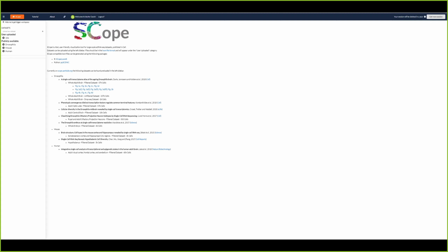A couple of caveats here. One is these are all pre-recorded videos. Hopefully they'll play at full frame rate, so you'll see them nicely. We're at 500,000 cells, which is the highest we really used with Scope, and that can sometimes bring some kind of long waits. So all of these videos are edited to make the pauses go away, the loading times are shrunk, but you'll see everything that you can do. You'll just have to wait a bit longer if you do it live.